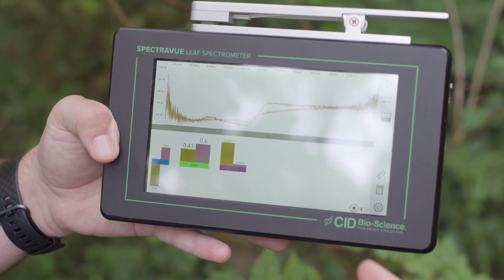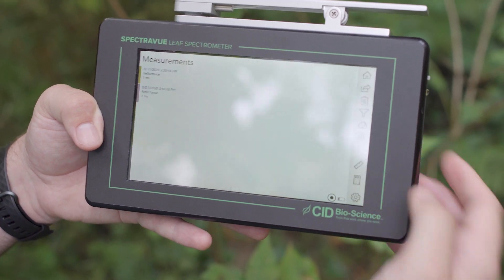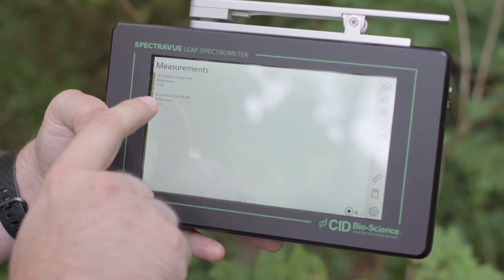You can also export all this data. You can simply view your measurements by clicking the ruler here, and you can see these two measurements that I took, and the time and the date at which they were taken.